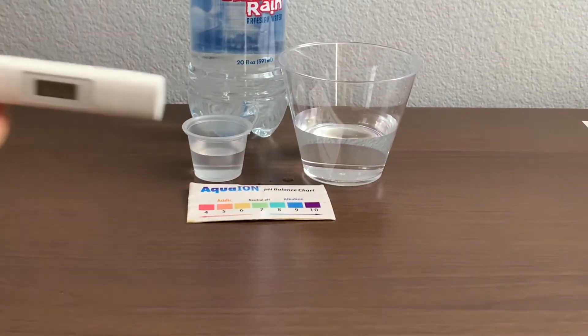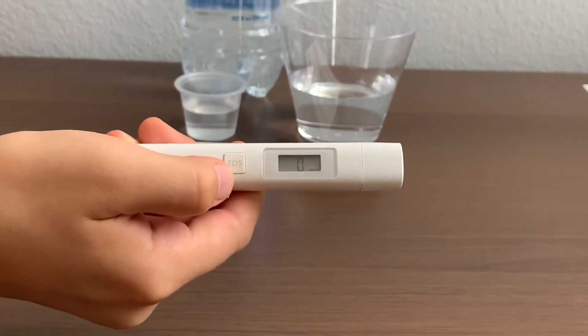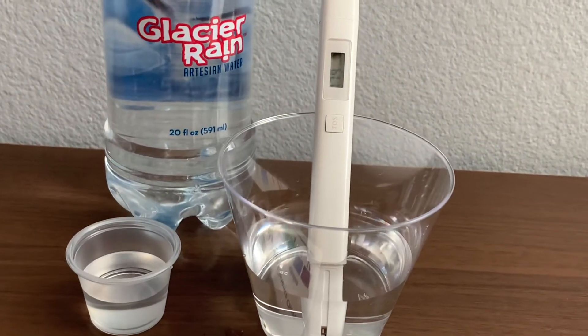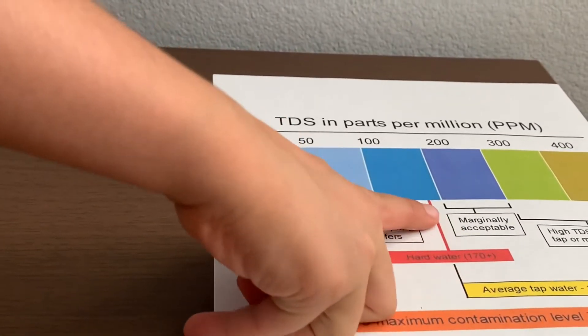First, let's test the TDS level. Turn on the TDS tester, make sure it says 0, and put it in. One hundred seventy-nine. That is high TDS water.